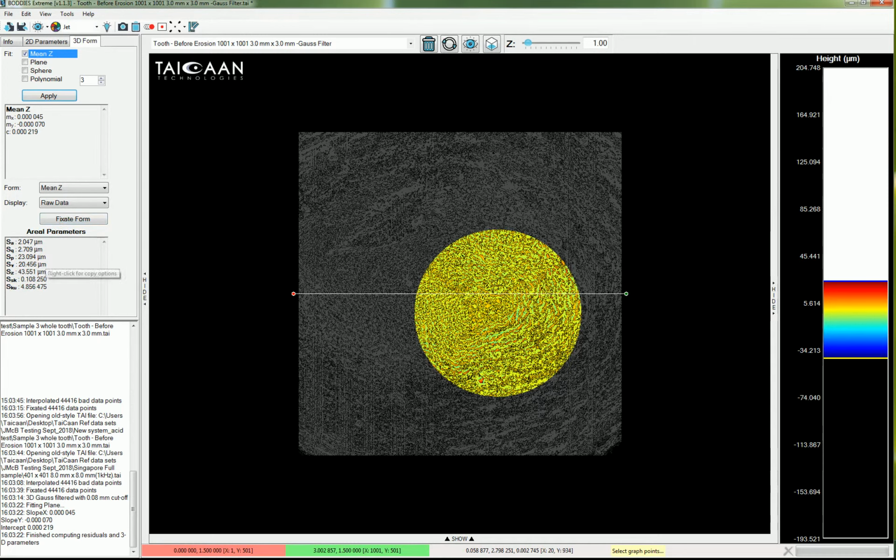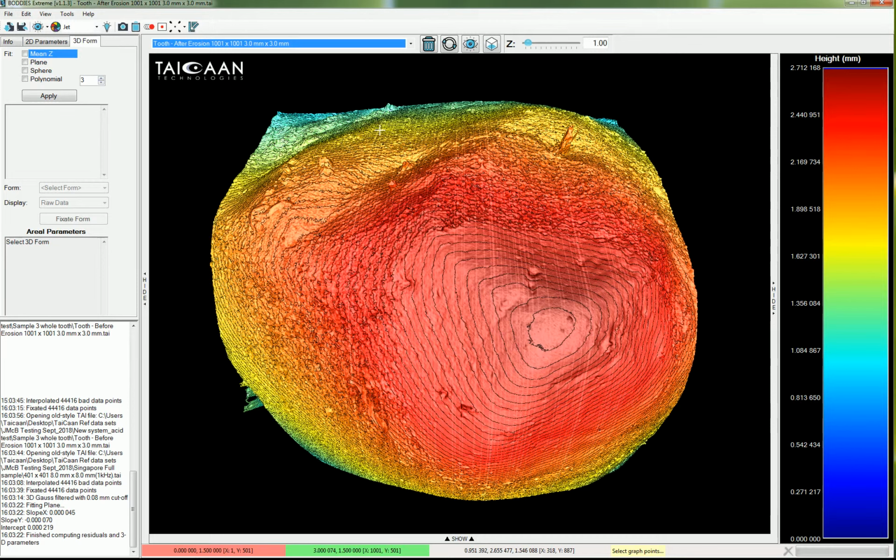Now let's go and do the same thing to the measurement of the same surface after we've applied the citric acid, the diluted citric acid. And I think you can see straight away what's happened here. You can see a smoothing effect, very evident with the contours we've selected here. I've still got the light on here. Turn the light off.